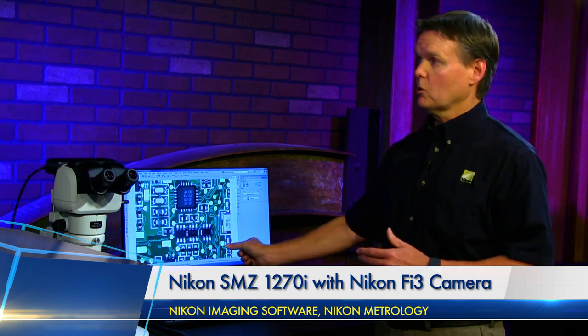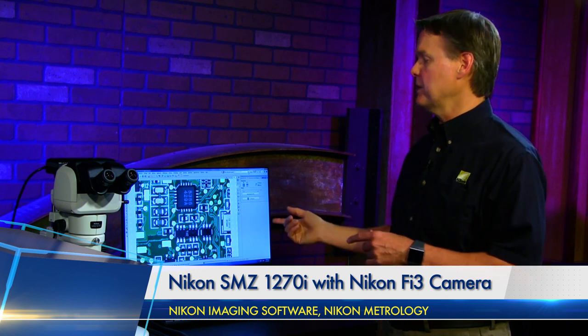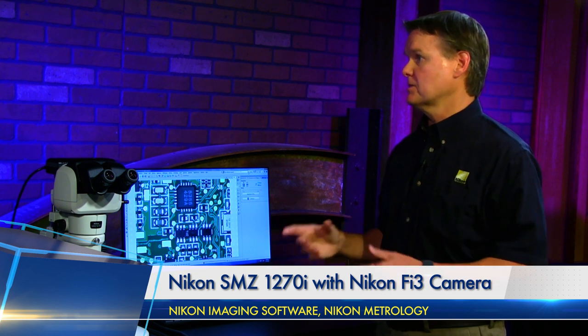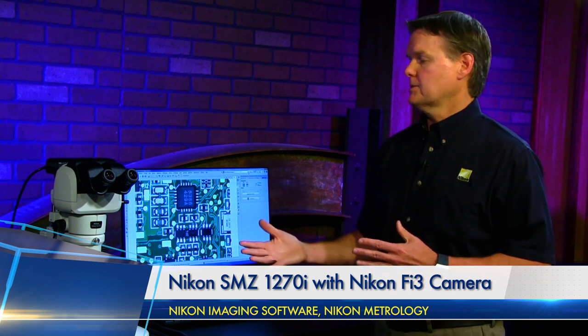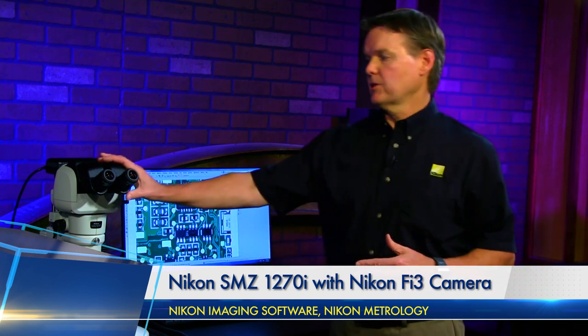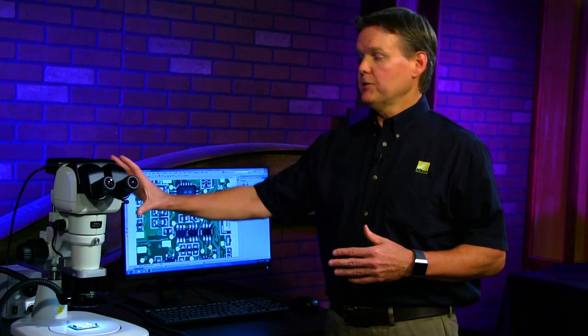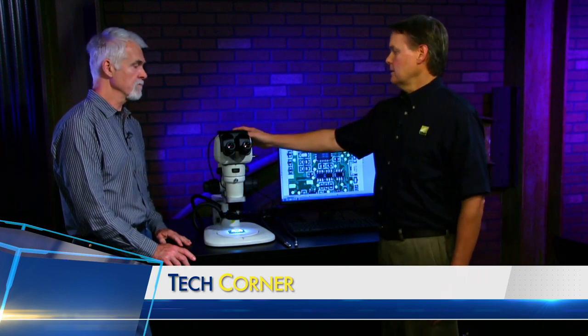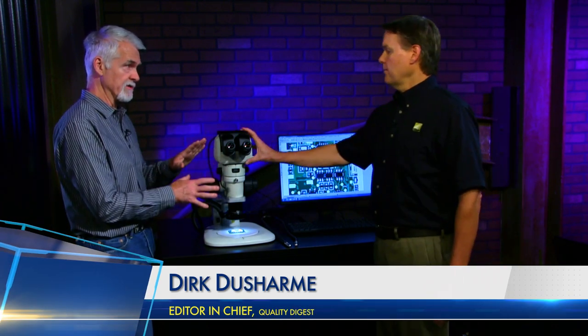This is useful for scale bars and rough distances. You can take measurements in the software, but it is a stereoscope, so it's not going to be super high accuracy—it's more of a reference. All our stereoscopes are very modular. On this one, we have an ergonomic tilting Trinoc with 10x eyepieces. If you didn't need a camera, you could get this with just a Binoc. If you didn't need the ergonomic feature, we have fixed-angled eyepieces as well. The Trinoc is modular in that it'll go on other zoom bodies.